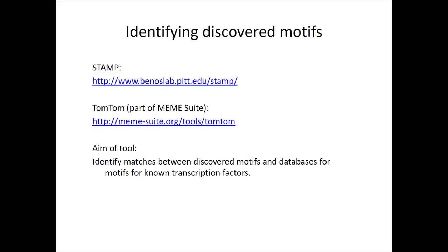So, in this part I have given a brief overview of what motif discovery entails. Weeder is a great first port of call and is easily implemented in Galaxy. Once you have a set of discovered motifs, you can look to see whether they resemble anything in the databases of known transcription factors, if that's applicable to you.